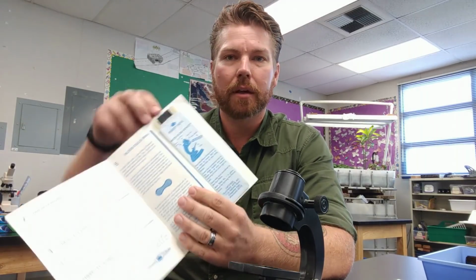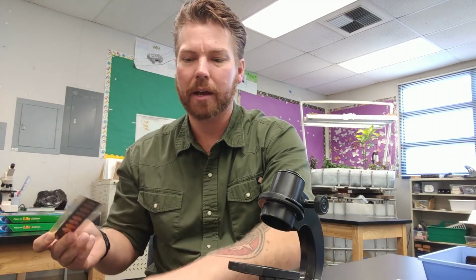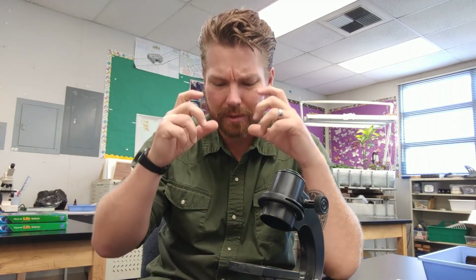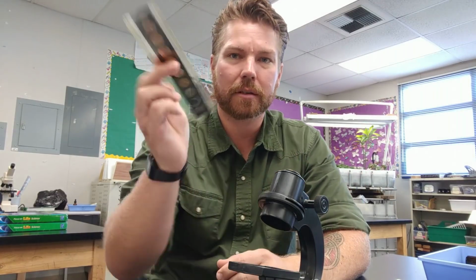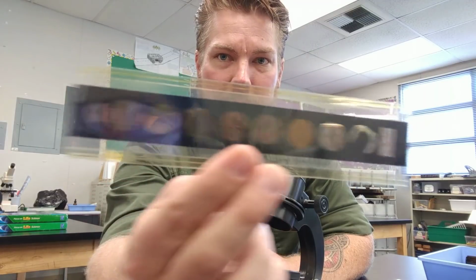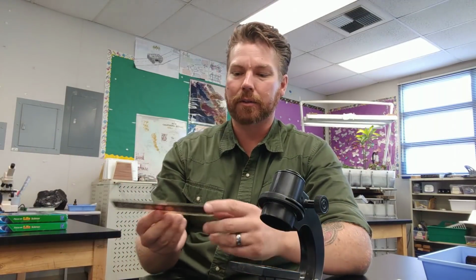We want to open that up, and there should be a piece of film in here. The microviewer kind of works like one of those things that you put the disc in and you click the thing and you look through it. Each of these pieces of film has a bunch of different images on them, basically what you would see if you were looking at them through a microscope.